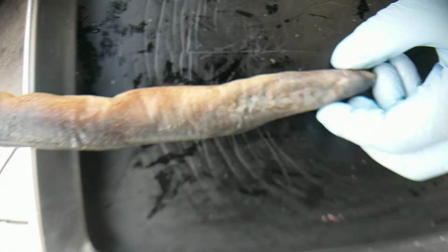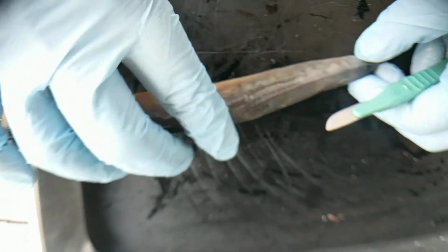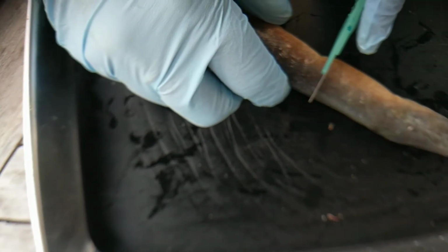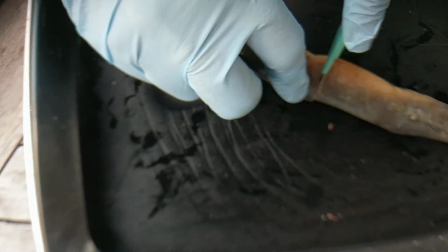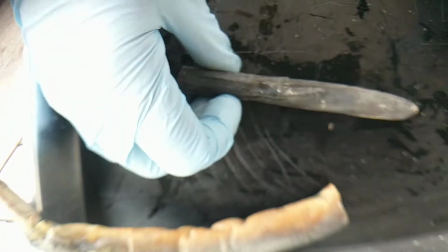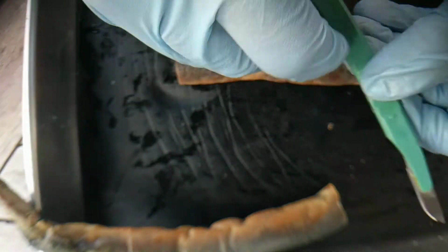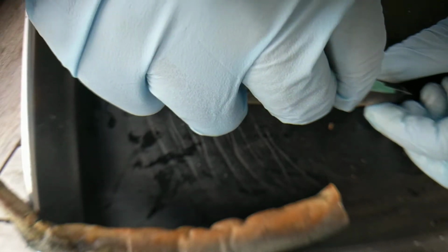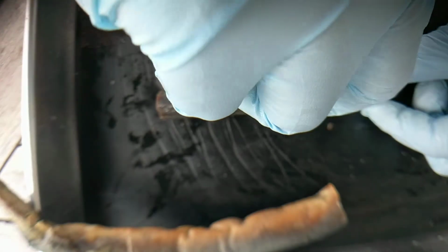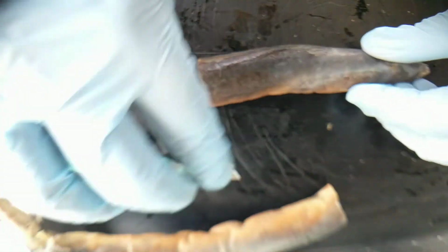Okay, so the next thing I want to do is a sagittal section. The sagittal section means I'm going to cut it right down the center lengthwise, like that. That's called a sagittal section. So I'm going to rotate it up here. First, actually, I'm going to cut a transverse section through the trunk, and we'll look at that later. That makes it a little easier for me to cut this anterior part sagittally. So I'm going to try and go straight through the middle so we can look at that pineal gland in detail, and also some of the important chordate features. Hopefully I got through the center here. Okay.